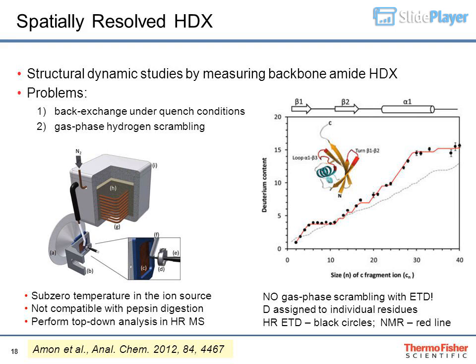A flow of nitrogen gas cooled to sub-zero temperature is generated by passing it through a coil of copper tubing immersed in dry ice. The inset shows how the cold gas flow is directed to the front of the pipette tip, containing the sample solution, that is in direct contact with the ESI chip.